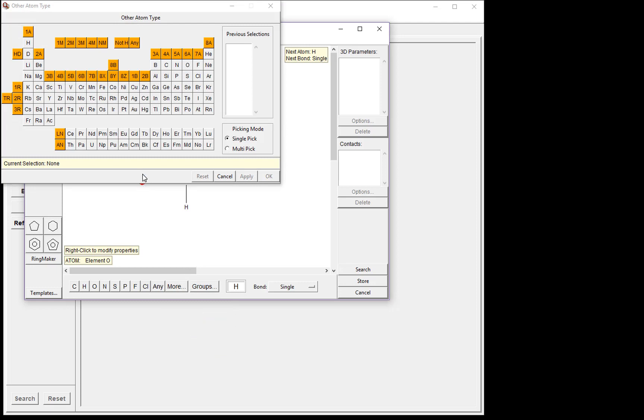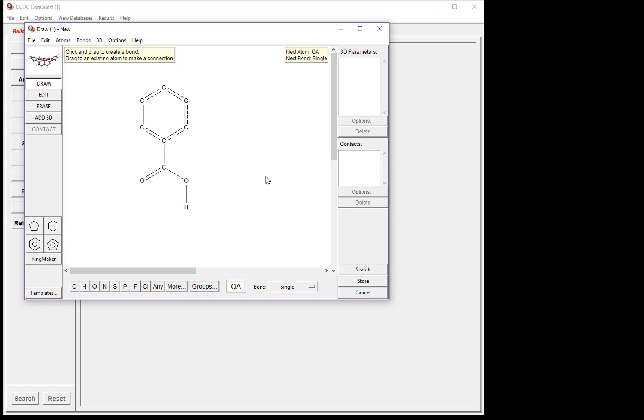So first, tick the box that says Multipick in picking mode. Then click on the nitrogen and the oxygen to select them both. Click OK when you are done. This changes the atom type to QA. If we click in the drawing window, you'll see we've put a QA atom here, and down below it shows that the atom type is variable, either nitrogen or oxygen.